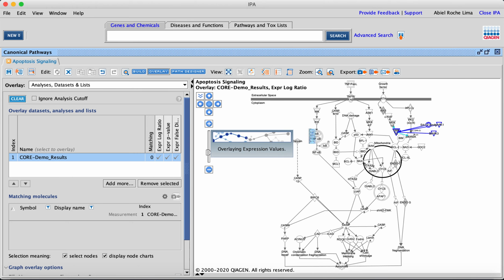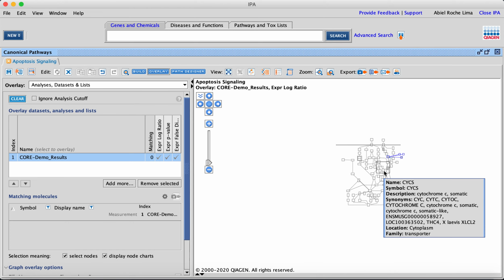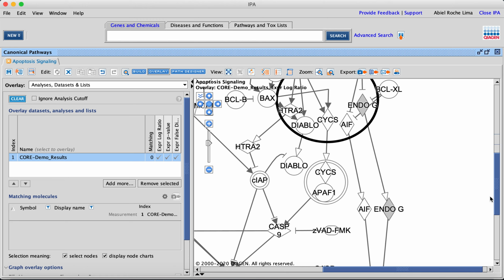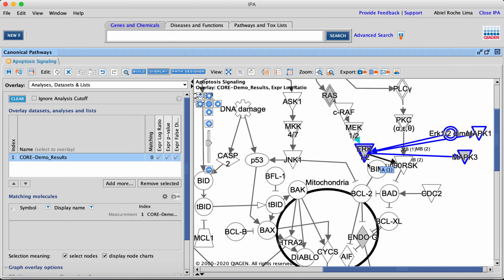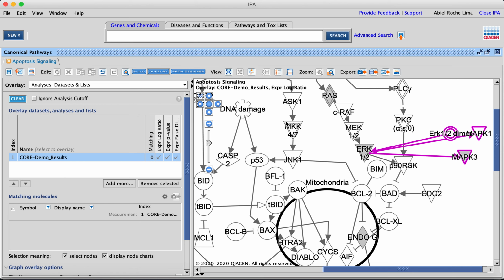So, as well as the nodes, the edges may also vary. In the nodes, if it's double, it means that it's a dimer. You have something like a double line between the nodes because it's a complex, a dimer or a complex.